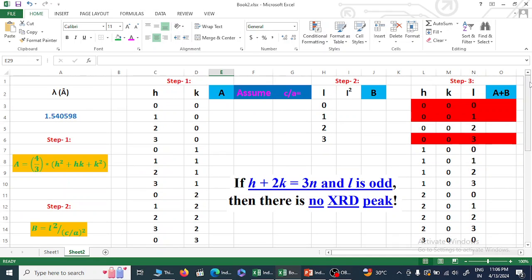Please follow the exact thing what I am saying. Then the whole calculation will be very easy. Otherwise, it will make a very complicated thing. Now, first, what I told that this is our A value, correct? Can you remember this thing?